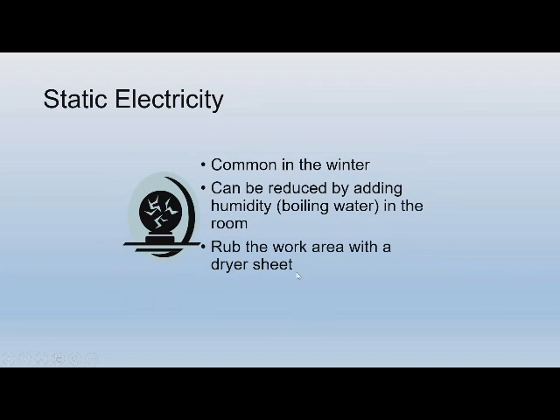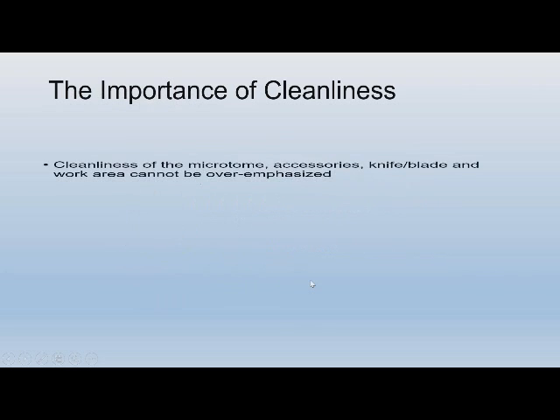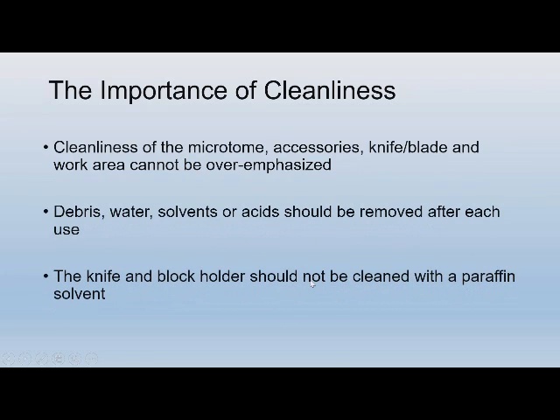Static electricity, I'll just barely mention, common in the winter. Get a humidifier. I wouldn't bother boiling water. This is an old slide. We did used to rub the work area with a dryer sheet, and it really did help. And of course, you can always blow on the section if you want to do that.